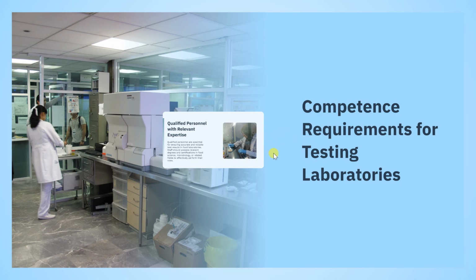If someone says, I know how to operate HPLC and I know how to operate AAS, atomic absorption spectroscopy, or any other sophisticated equipment, you should be able to operate the equipment without wasting time and resources over employees that are not competent. And if it is found that some of your employees are not well equipped, please provide training for those employees.